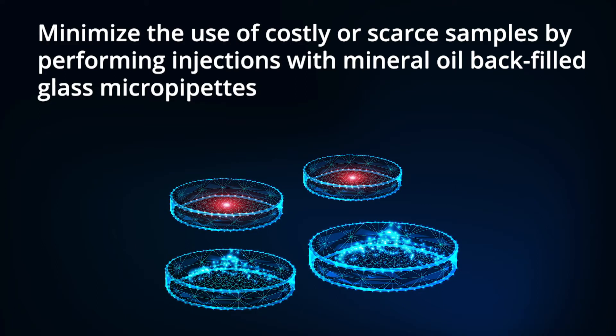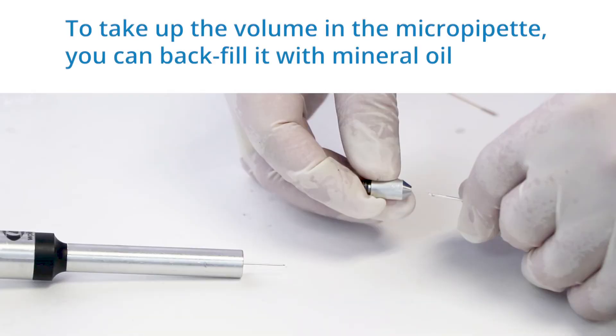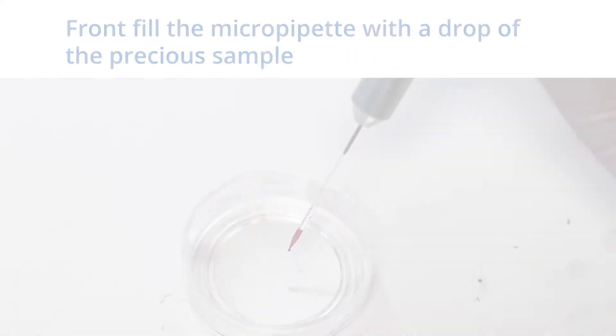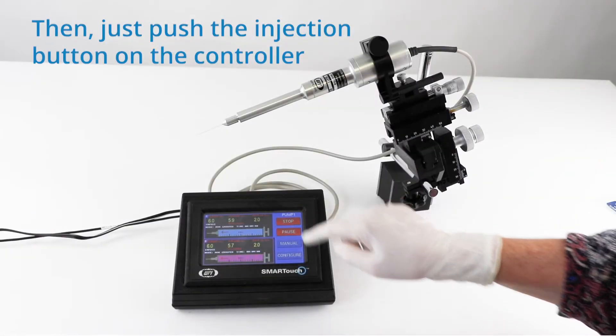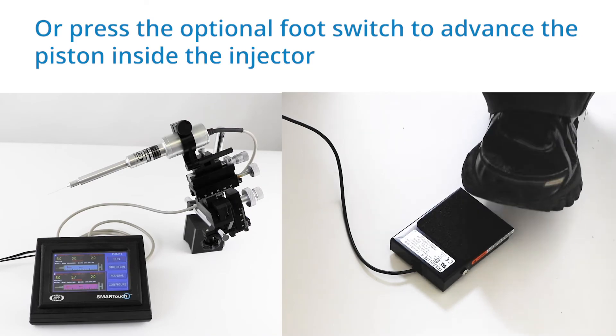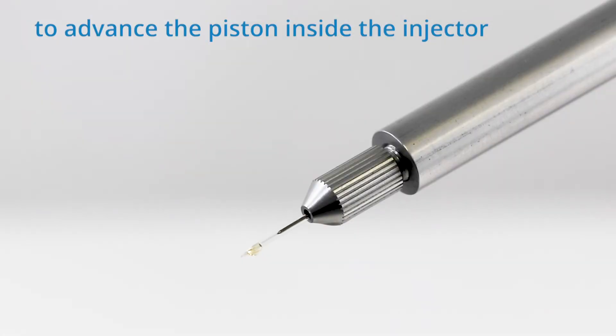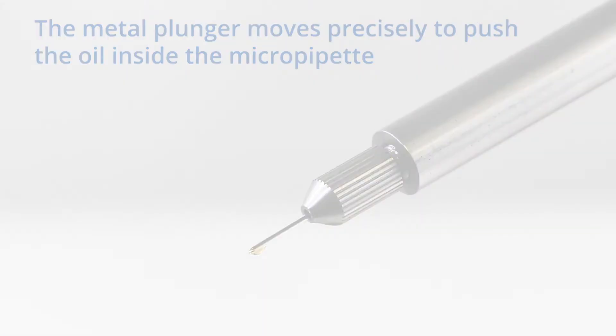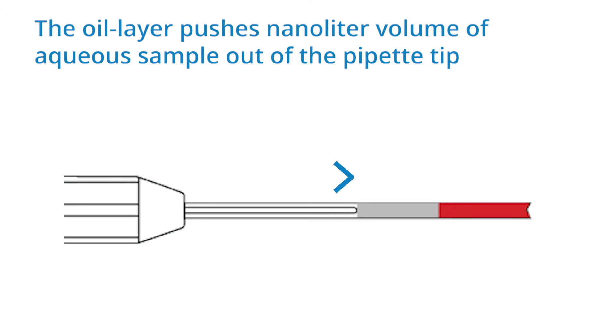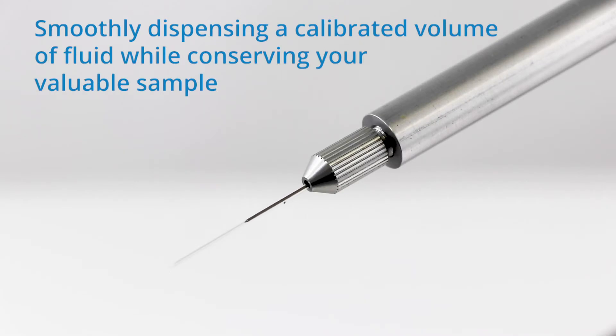Second, you can minimize the use of costly or scarce samples by performing injections with mineral oil backfilled glass micropipettes. To take up the volume in the micropipette, you can backfill it with mineral oil and then front fill the micropipette with just a drop of the precious sample. Then just push the injection button on the controller or press the optional foot switch to advance the piston inside the injector. The metal plunger moves precisely to push the oil inside the micropipette, and the oil layer pushes nanoliter volumes of aqueous sample out the pipette tip.